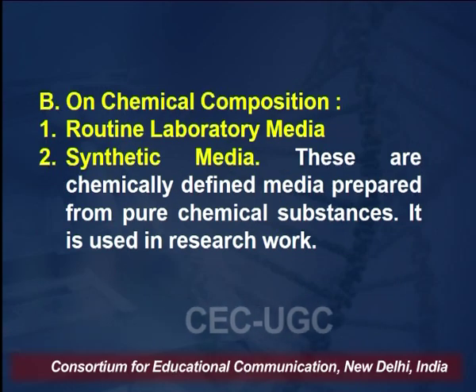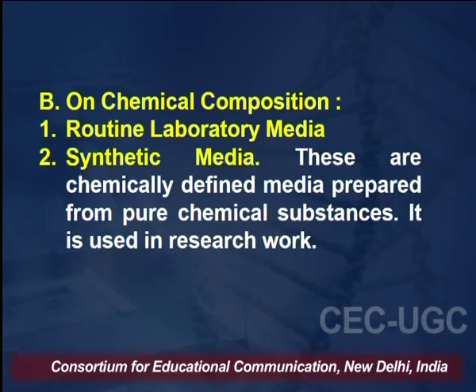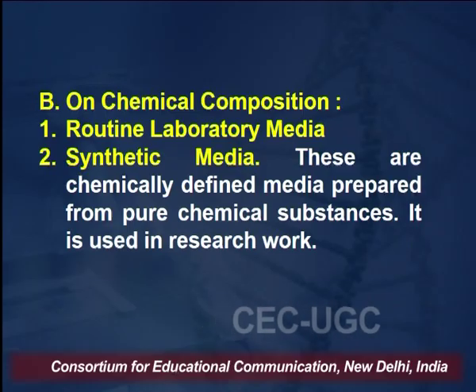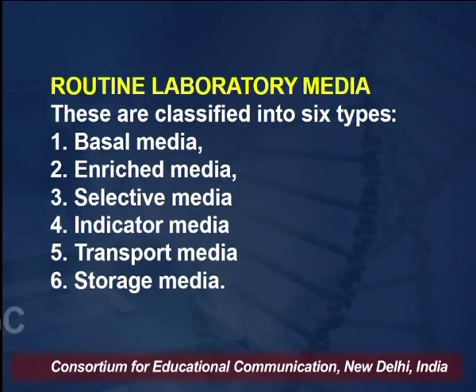Based on the chemical composition, media can be the routine lab media or the synthetic media. The synthetic media are usually chemically defined media which are prepared from pure chemical substances. They are used in the research work. The routine lab media are not well defined.